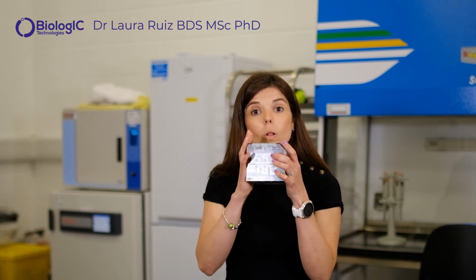Then, we convert your digital TDK into a physical TDK. We use 3D printing to manufacture it. Specifically, we use multi-material 3D printing that allows us to print the entire TDK all in one. We print the fluidics, thermals, optics, and pneumatic circuits into an integrated bioreactor system. Then the TDK is ready for your testing and start optimizing your process.